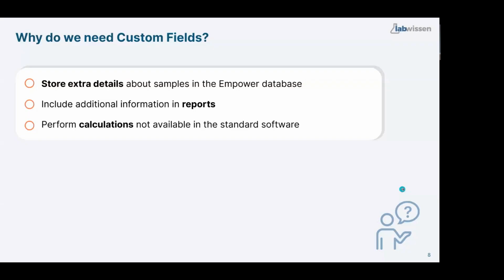So why do we need custom fields? First of all, to store extra details about samples in the Empower database. So all your information about your analysis, you can enter in Empower in the custom fields you built. And when something is already inside Empower, it's secure, it's safe, you cannot delete it, it will not disappear. So you have everything in the Empower database.